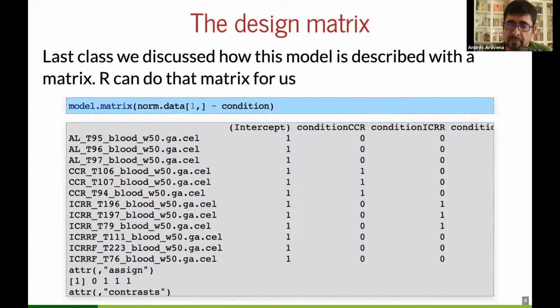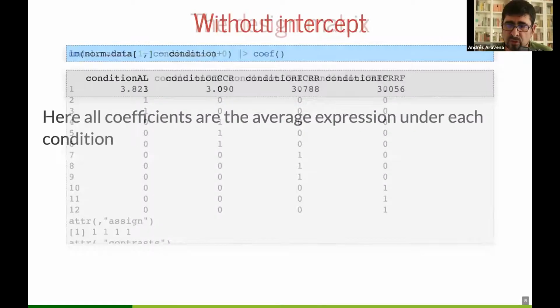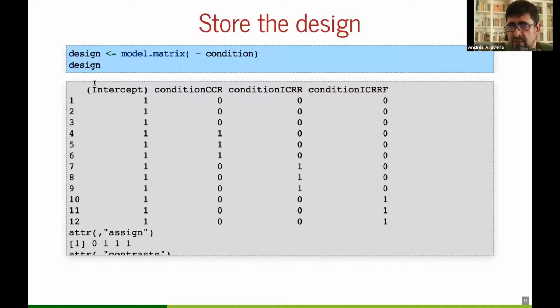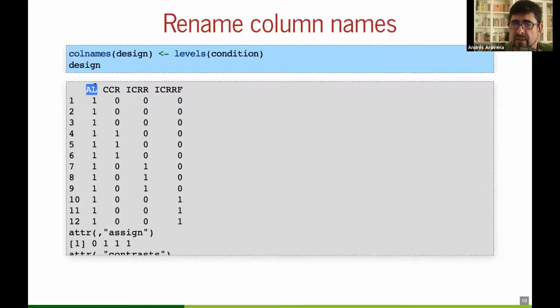And since they are replicas, we use a factor to identify the replicas. They essentially call it like this: ad libitum, CCR, ad libitum, calorie restriction, intermittent calorie restriction.